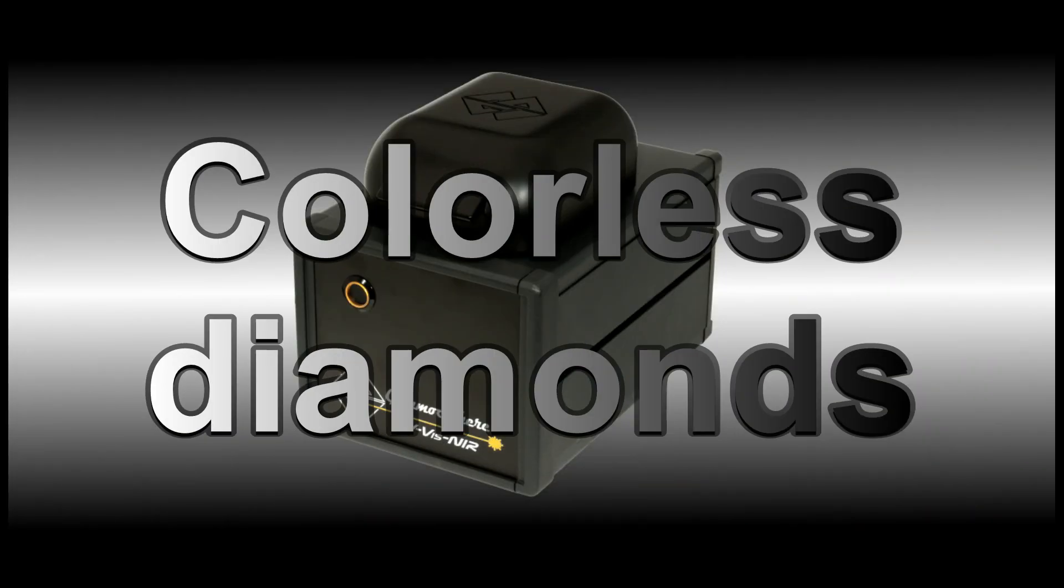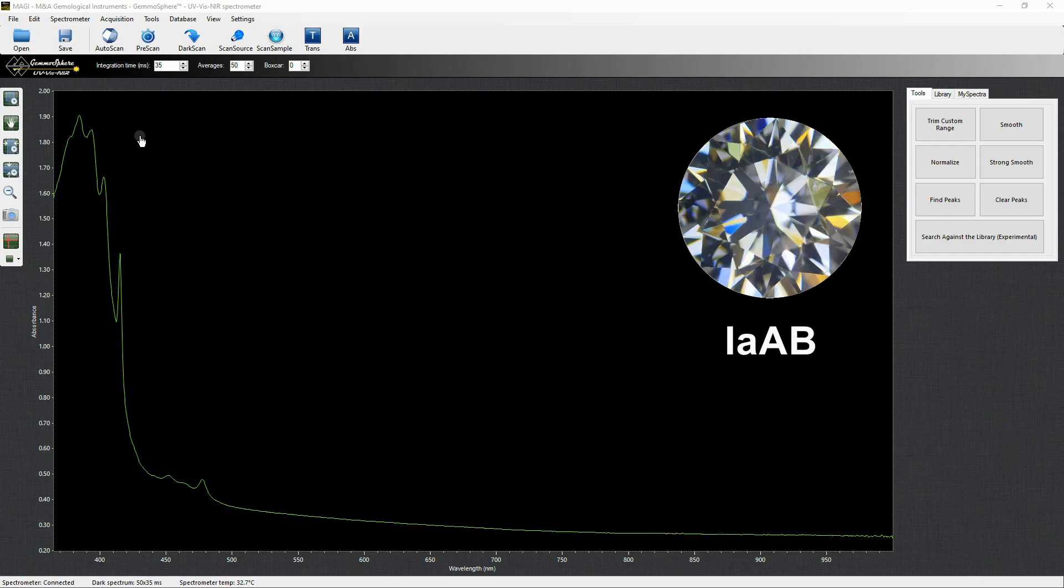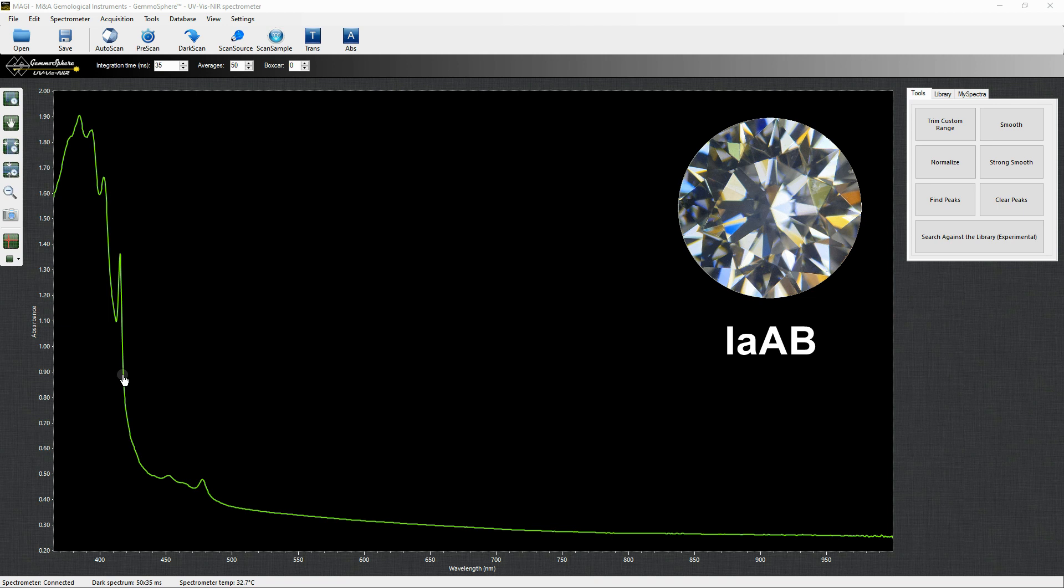Colorless diamonds. This is the most common absorption spectrum of a colorless diamond. 98% of diamonds contain nitrogen in aggregate form as defects in the crystal lattice.